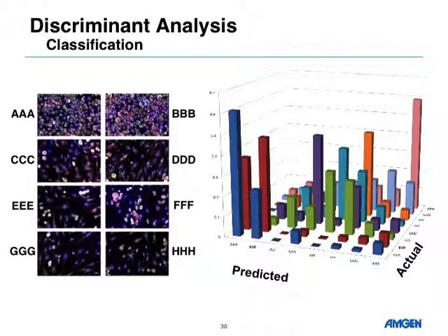of my actual population of, say, A, using my different tools I've been able to segment out and say most of these are A and some of them are B. They look pretty much the same by eye, but the different morphometric parameters we've been using can actually separate those out and start to differentiate between those two.